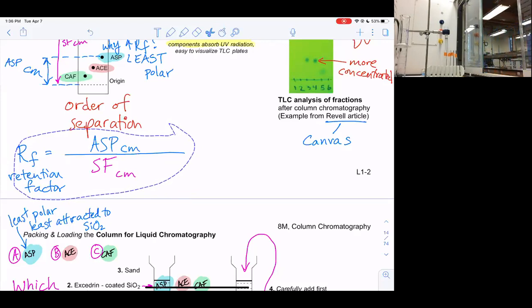We're going to take another break here. I'm just going to read this question. So to clarify, he changed to 1-1-1. So Avery was actually collecting the eluent from the 1-1 solvent in fractions 1 and 2. There is maybe a little bit of overlap in fraction 2, like maybe some of the 1-2 came out in fraction 2, but the one thing that maybe isn't so clear to see is that the column itself has a volume of solvent it can keep. So even though we're adding the 1-2 on the top, there is still the 1-1 solvent on the bottom. And so that's what's actually dripping out. So that's the part that might be a little misleading or confusing.